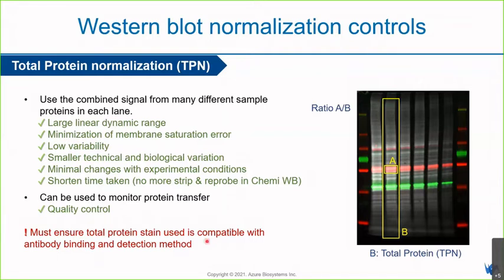But we must make sure that the total protein stain used is compatible with your antibody binding and detection method that you use in the current or existing Western blotting protocol.